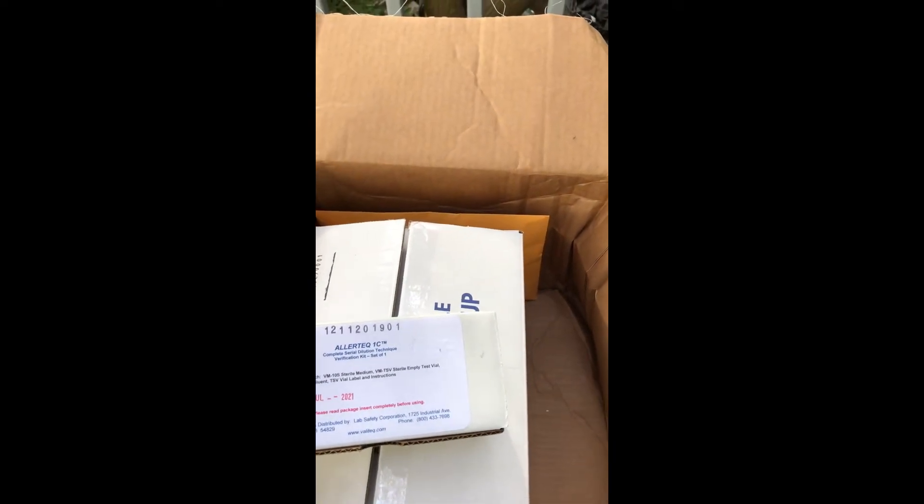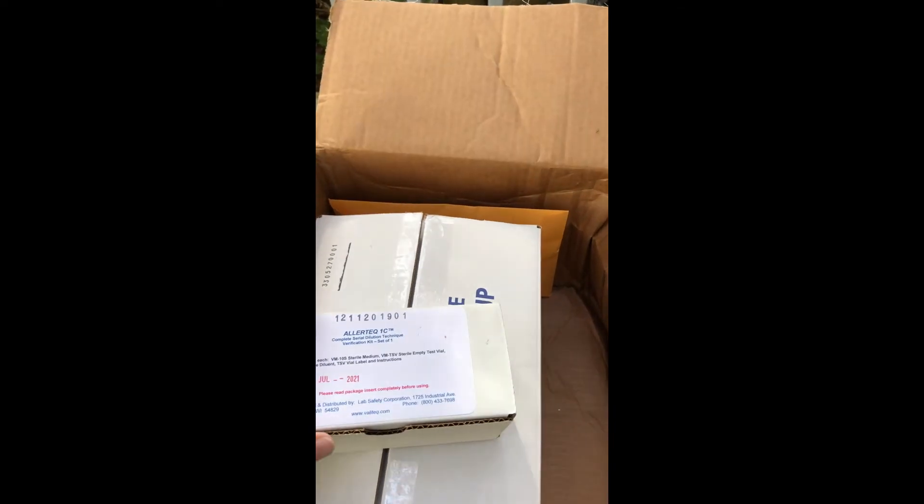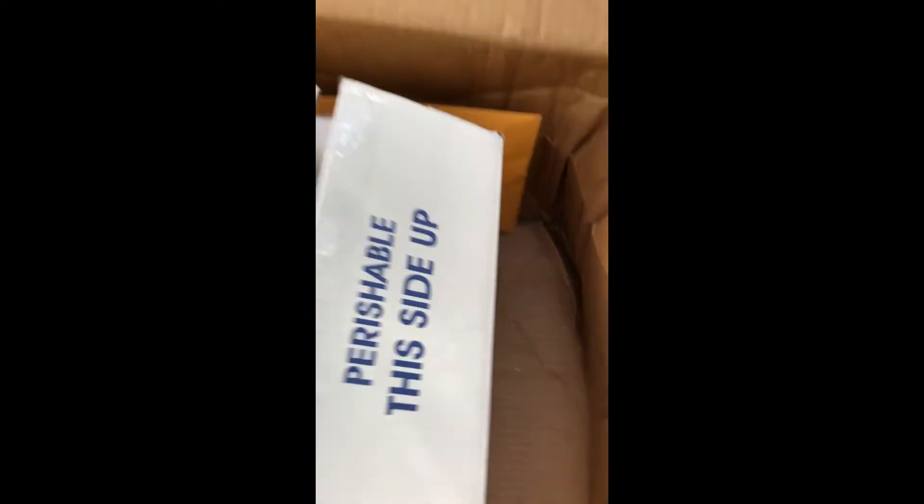All 15 steps. For the test kits, you will have the media fill test kit. It looks like this — this is one complete test. Inside are your vials, as well as the instructions and the shipping information.